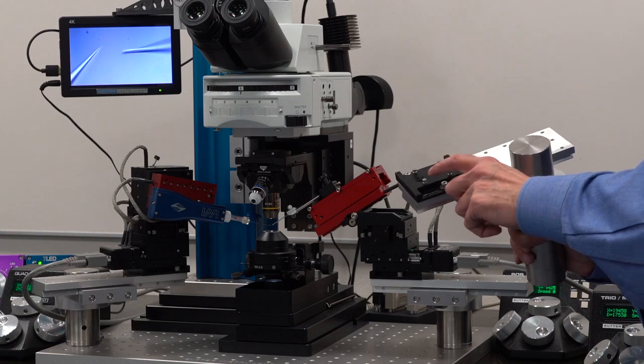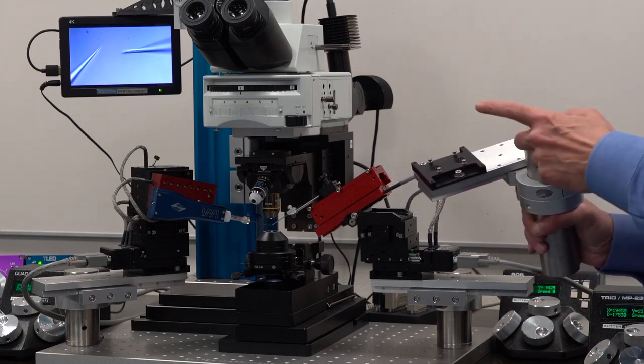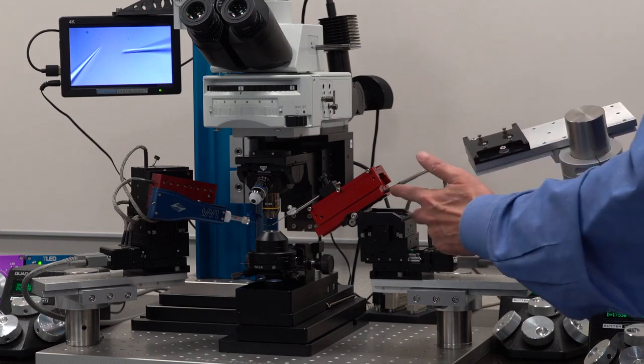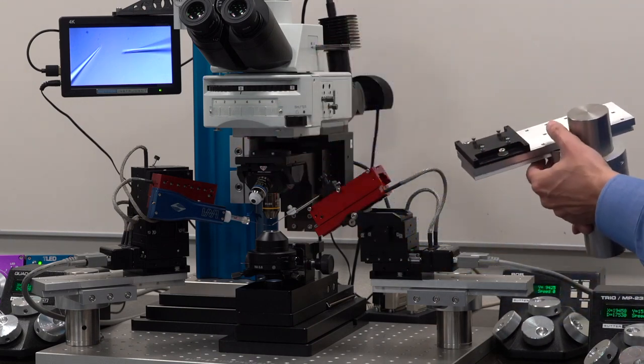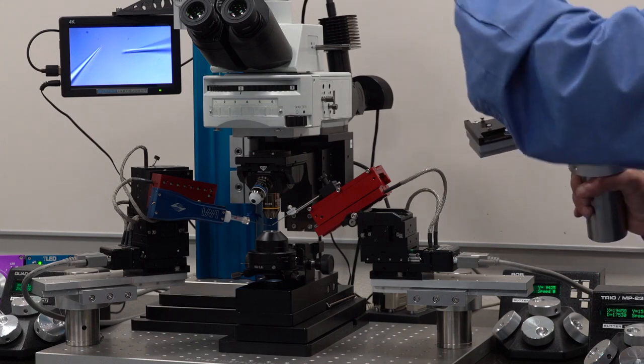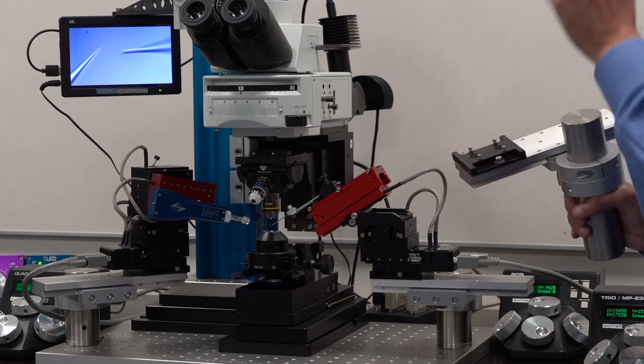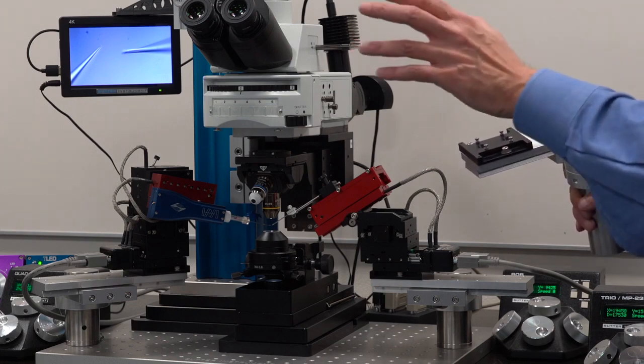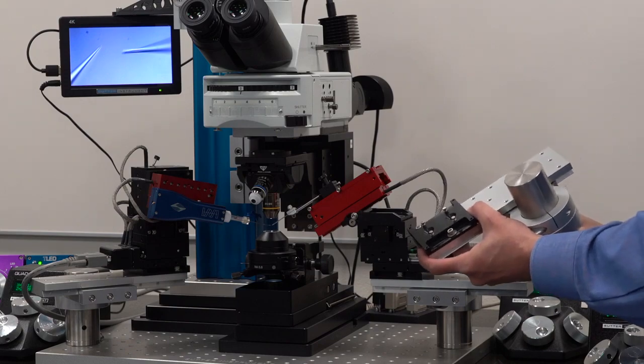By the way, this is the adapter plate that we use to connect any of our manipulators. Over here, I've spoken about the 235, the quad. Earlier, I spoke about the 865, the 30845, the MP225, the MP285. In order to install any of them on any surface, you need to first install this adapter plate.